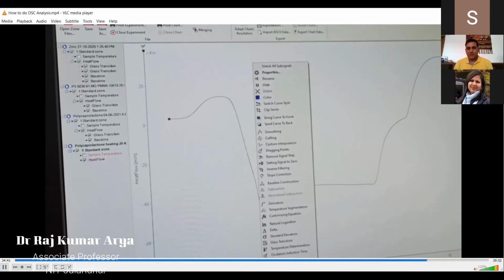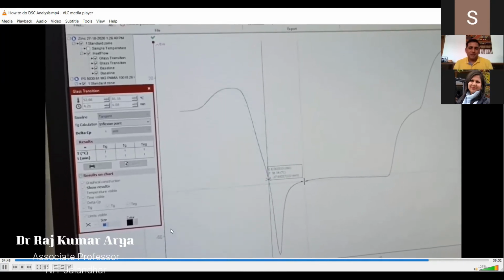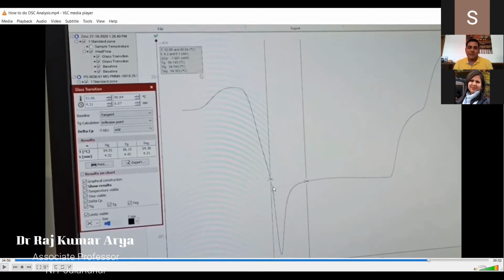Find Tg. You can select the Tg from here, and you can choose maybe a point here and maybe at this end. In this case, I just want to mention that the software gives a tool with which you can find the Tg by clicking at 2 points, but it doesn't mean that you can click anywhere, right? You should know where it needs to be clicked. It is the transition part here. Let's say this was your heating curve. If you want Tg, you have to put the point where the transition is just starting, where it is dipping like that. After that it gets to the end, so the end would be something like that, and then it will go up and become constant. Then it's called the end of that, meaning a completely S-shaped type of thing. There you will find the Tg only.